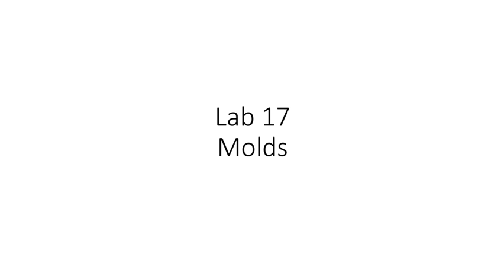This is our second fungus lab where we will be focusing on molds as opposed to yeasts. Molds are the multicellular and in some cases macroscopic forms of fungus.